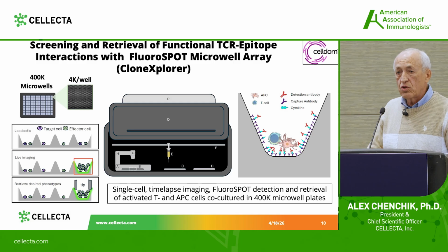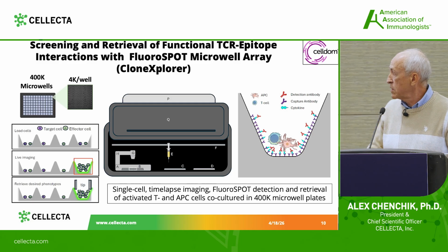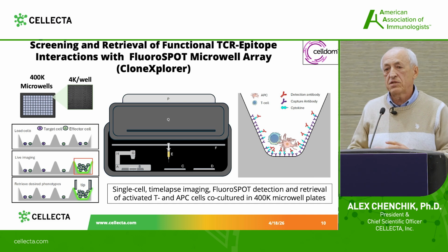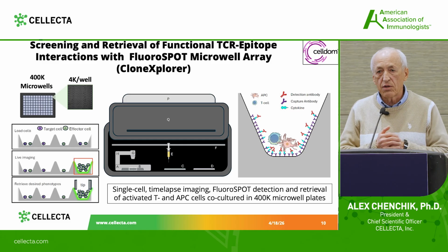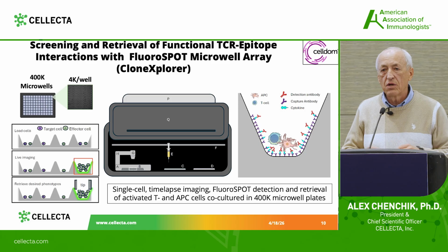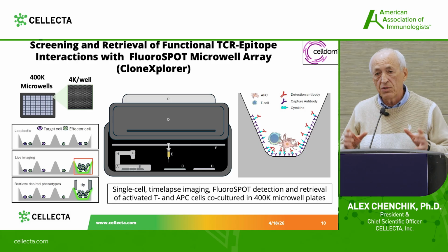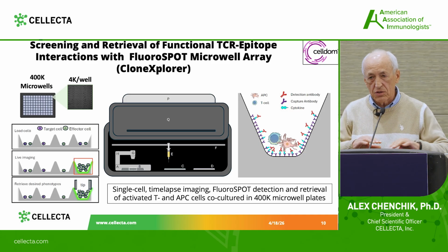In order to detect secretion, for example of interferon gamma, or to do any immune assay, it's also very cool. They have deposited on the surface of the well antibodies against, for example, interferon gamma. So if cells secrete interferon gamma, detection antibodies present in the liquid above these cells bind, and the cells start to be fluorescent. So you can immediately see if interferon gamma is secreted. You don't need to do any washing; it's just online.